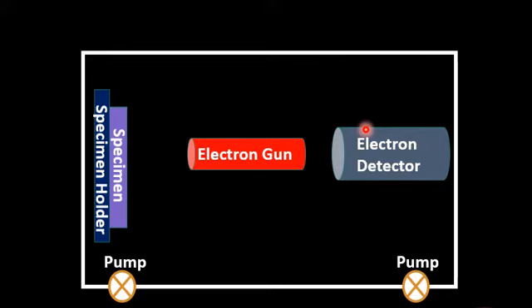Since you know that the Auger electrons emitted from the sample surface have less energy, the transmission of Auger electrons is also an issue, and the detection of the electrons is also an issue, because detecting low energy Auger electrons requires a special kind of Auger electron detector. So the cylindrical mirror shaped Auger electron analyzer or detector was developed to detect the low energy Auger electrons.